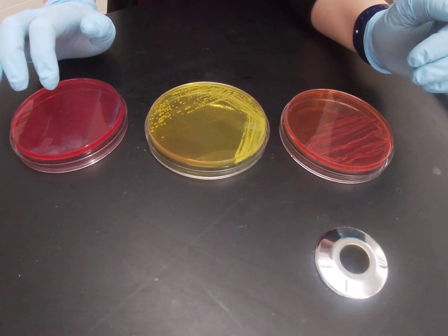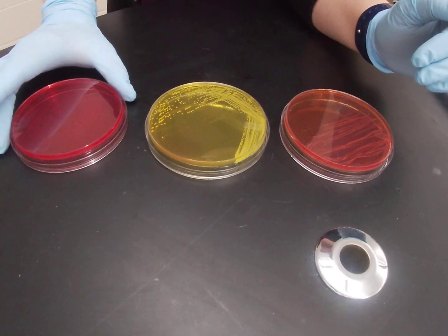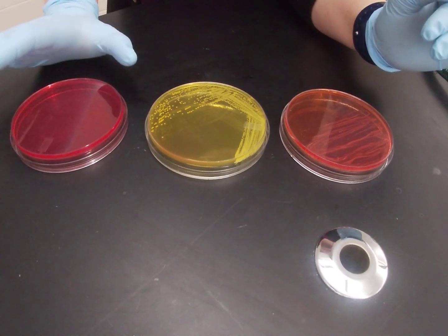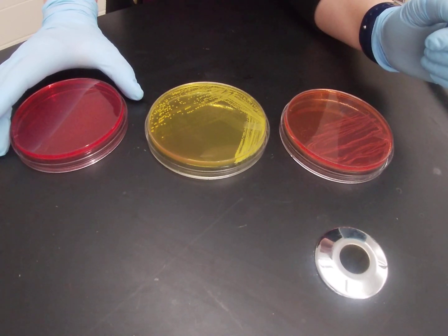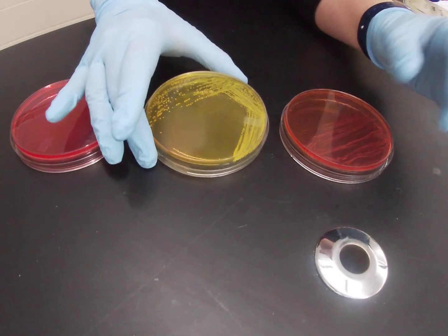Mannitol salt agar is differential based on mannitol fermentation. Mannitol is a sugar, and this agar contains both mannitol and also phenol red, which is a pH indicator. When organisms are able to ferment mannitol, they will break down that sugar and produce acid as a byproduct. And when they produce acid, that will work with that pH indicator to change the color of the agar.